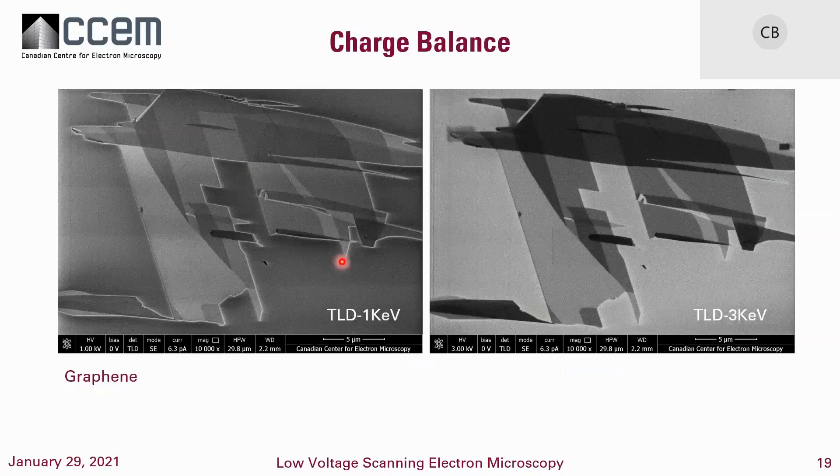There are a few materials with unusual behavior — Teflon and alumina, for instance, where you can sometimes achieve charge balance at higher kV. This is graphene here: we have some graphene sheets on a surface and we're getting charge balance at a certain kV, but at lower kV you can see bright charging. It's an effect you sometimes see in some materials.